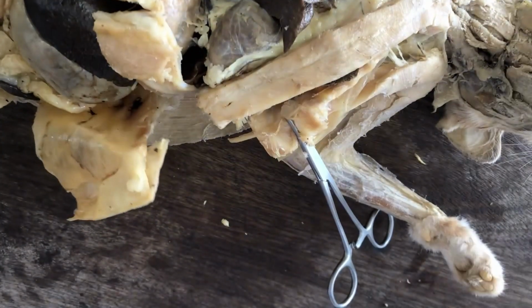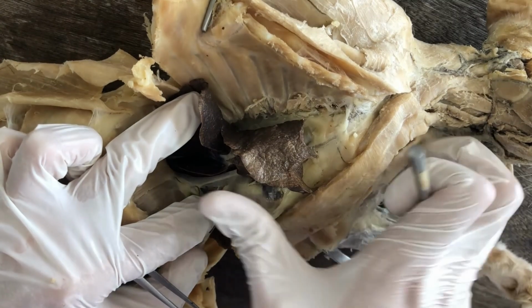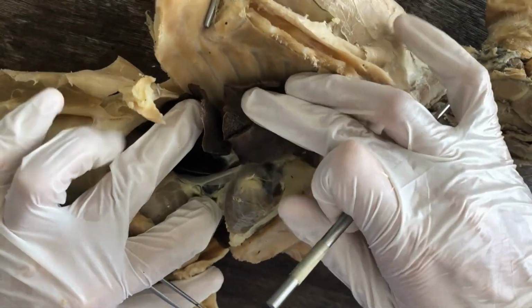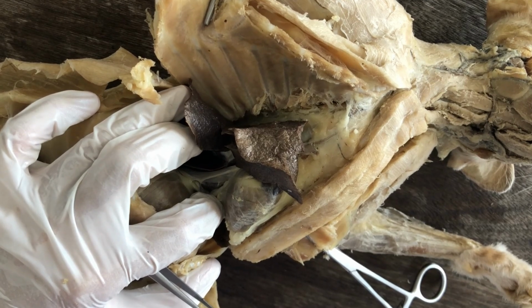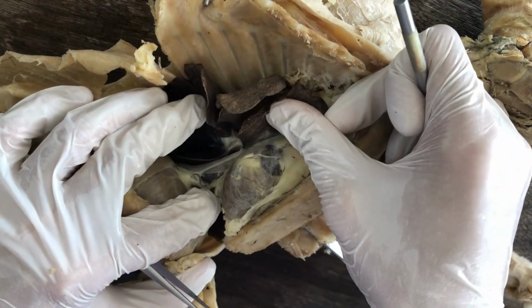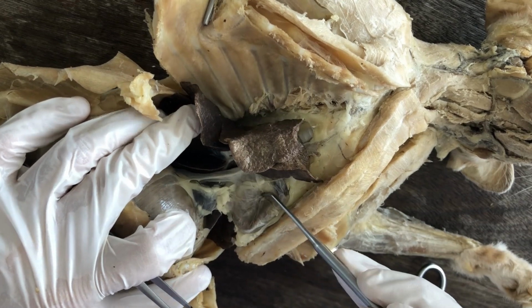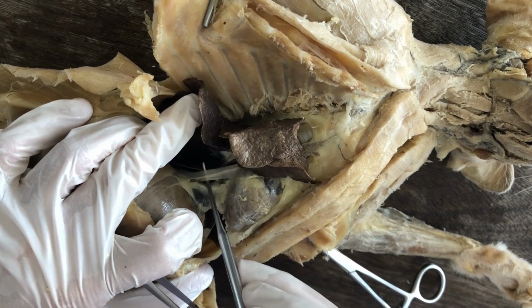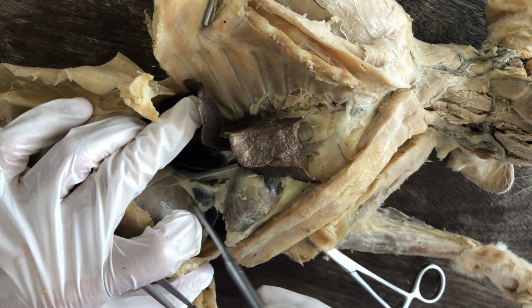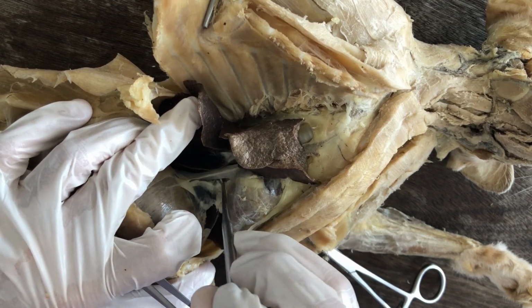Okay, I'll just skip once I've figured out how to show it. Okay, I hope you can see it. Let me focus. Okay, you see that? This is the heart. And there's another plastic-like tube down there. I have removed some of the caval fold so you can easily see.